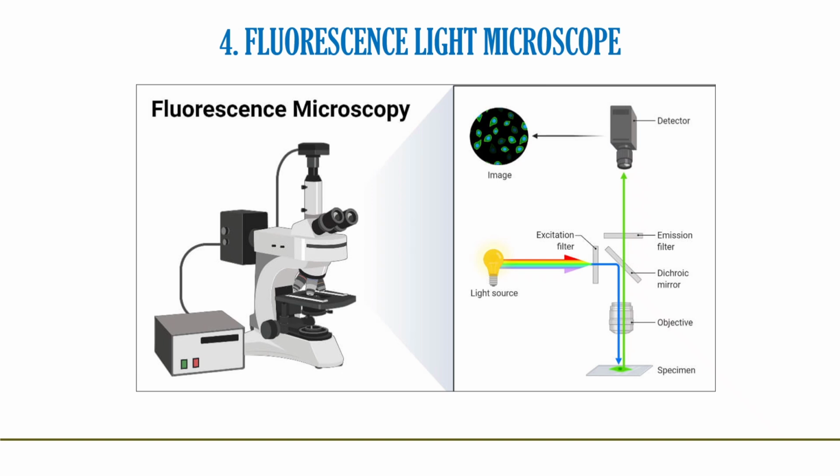Others are drugs or toxins which bind specific cellular structures and have been derivatized with a fluorescent reporter. A major example of this class of fluorescent stain is phalloidin, which is used to stain actin fibers in mammalian cells. There are many fluorescent molecules called fluorophores or fluorochromes, such as fluorescein, Alexa Fluors, or DyLight 488, which can be chemically linked to a different molecule which binds the target of interest within the sample.